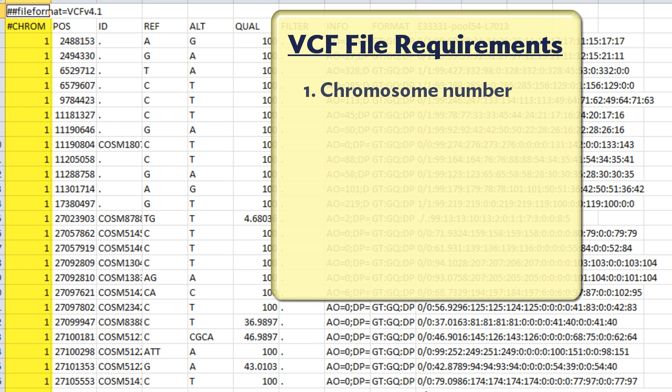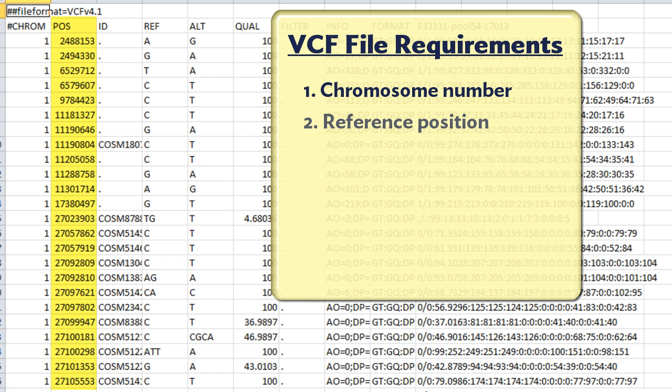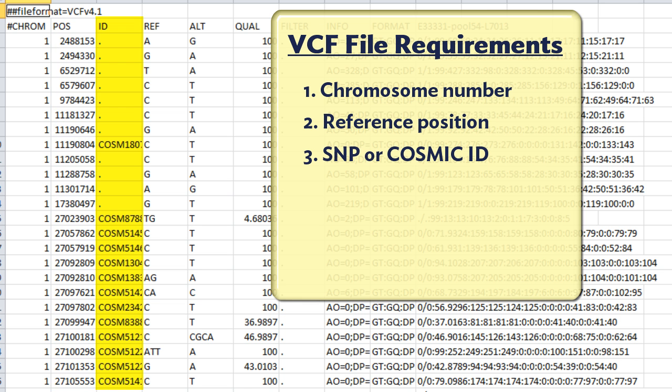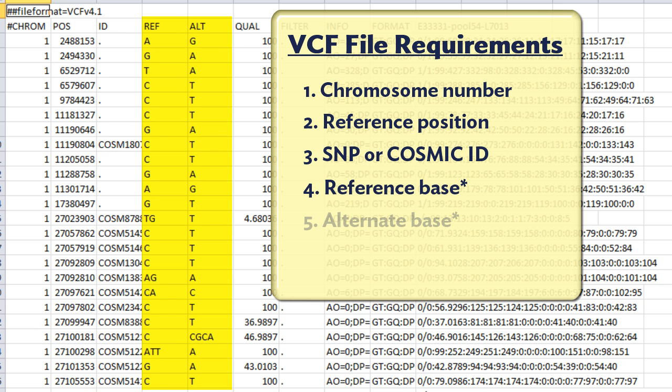The first column in the file must contain the chromosome number. The second column needs to show the reference position of the SNP. The third column shows the SNP ID or Cosmic ID number, and the fourth and fifth columns show the reference base and the alternate base call, respectively.